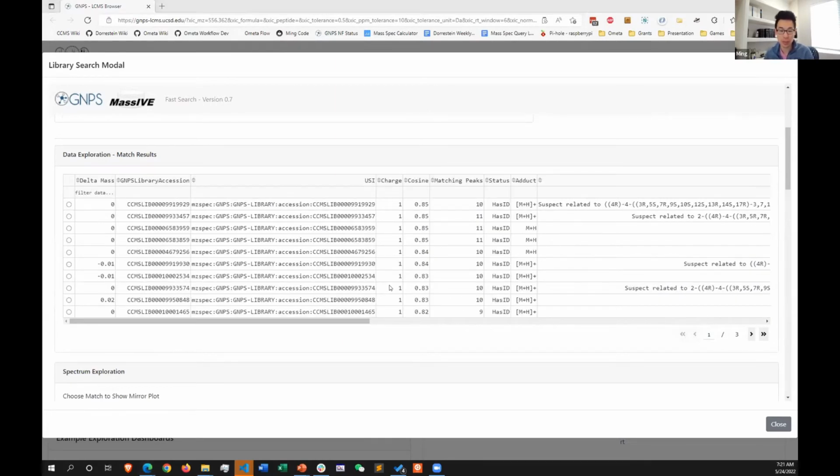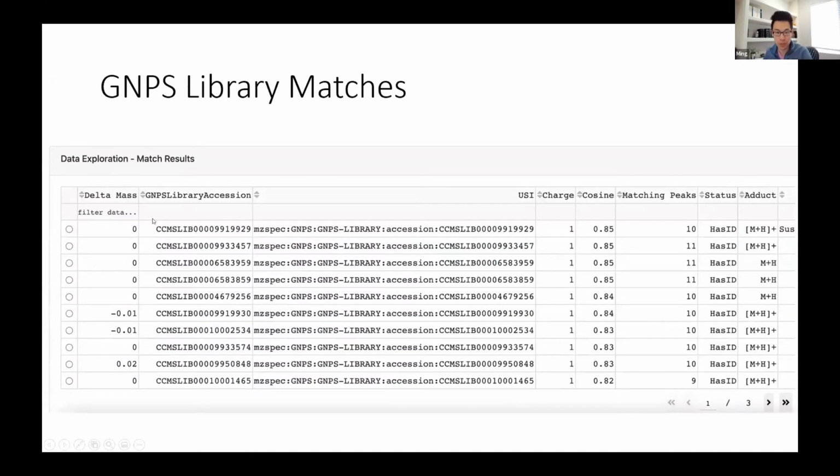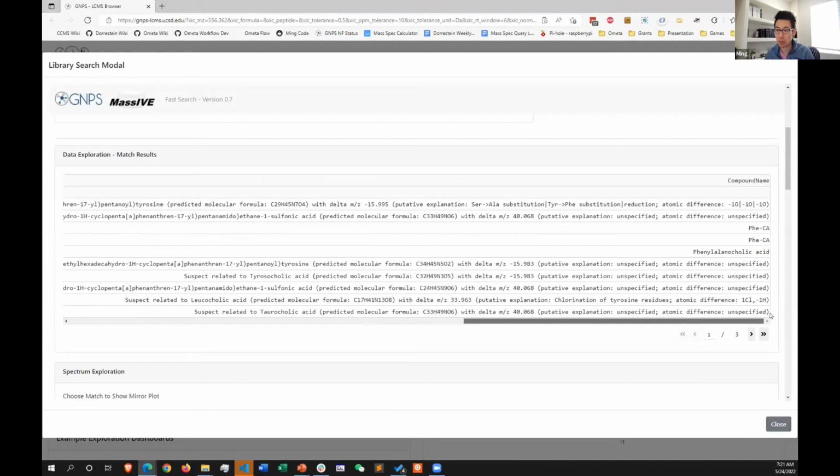So, let's go back to the presentation. You'll see this list, and you can go through it and scroll to the right. It's wider than my screen is. You can see the putative hits that it could be. If you take a quick look at that, you'll be able to tell what kind of molecule this might be. This is not particularly interesting because we already know that it's a phenylalanine conjugated bile acid, and that's what shows up at the very top. But this allows us to do that. You can click on any MSMS spectrum within your entire file and immediately have a putative library hit.